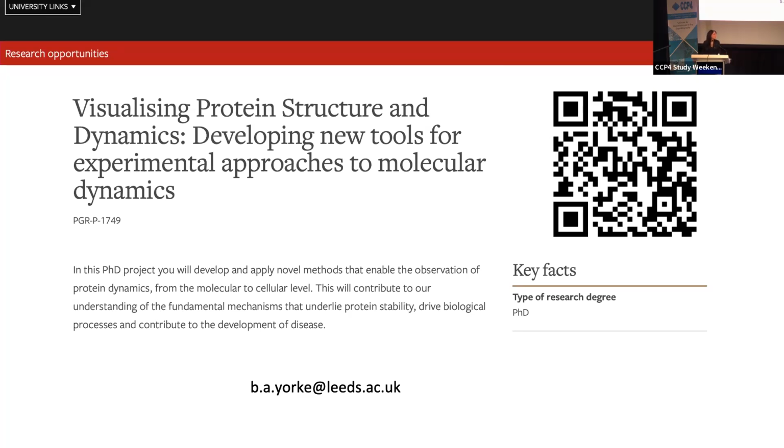Matt McLeod asks, have you grown crystals in glutathione to see if there is a difference between DTT and glutathione? Yeah, we've been trying to grow crystals in glutathione. I think we've just about now managed to get a structure of the glutathione bound. The process of glutathionylation seems to be much, much slower than the DTT addition. It's bigger. I think the actual structural changes that occur are much larger, and it might have more of an impact on the domains and the changes from the native state. But yeah, that is definitely on the way.